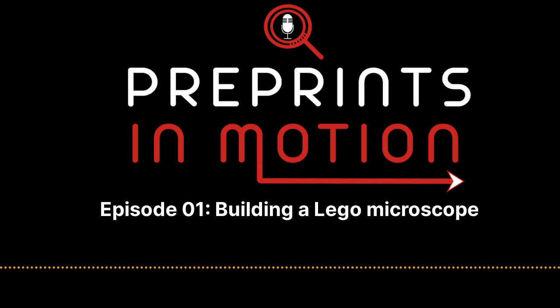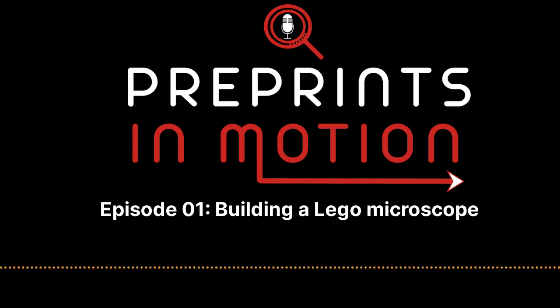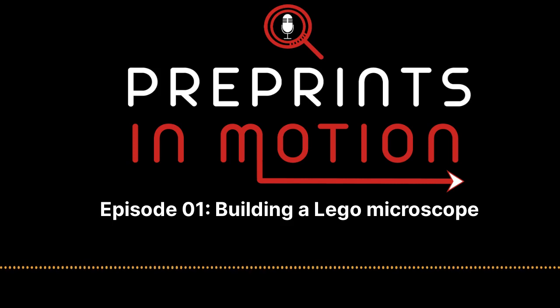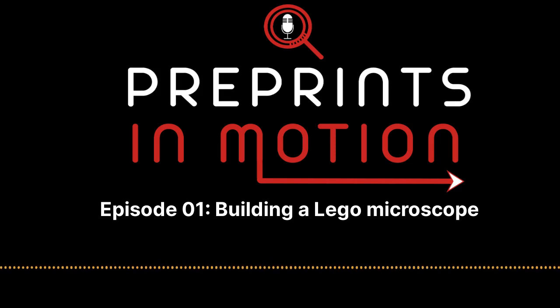So, talking about cost, the next step would presumably be something like 3D printed components. Or would you keep it as Lego? I think personally I want to keep it as Lego. So of course you can 3D print basically everything these days. I think the advantage of Lego is that you can change the design any moment you want. You don't need to print something again. You can just detach a brick, put it somewhere else and see if it works or not. So I think the versatility, and that is also part of the teaching aspect, is that really everything is modular. That is something that you get from Lego and not from 3D printing.